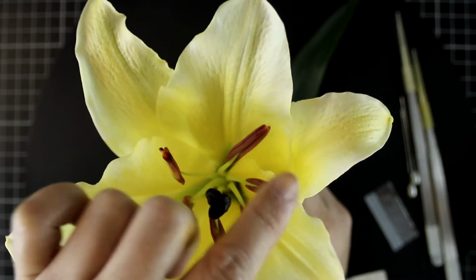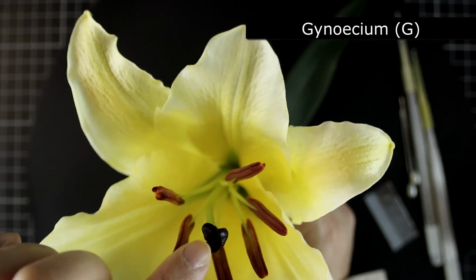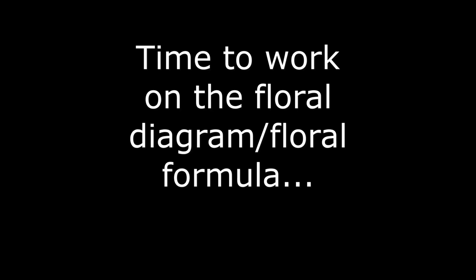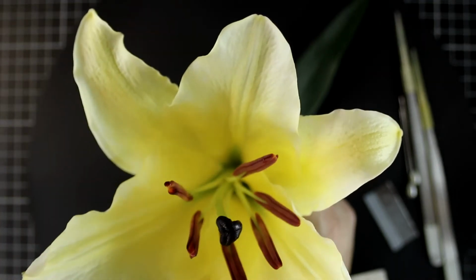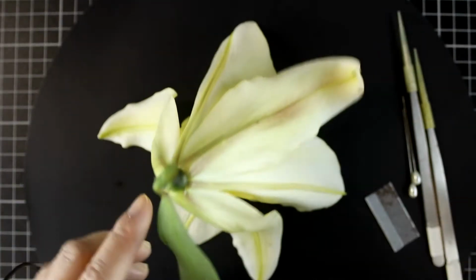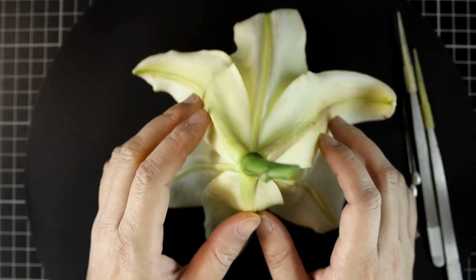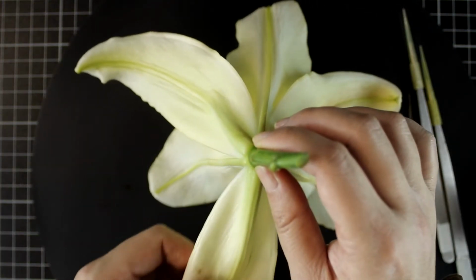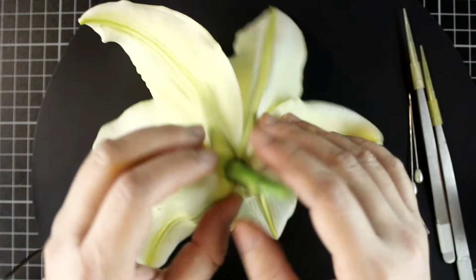Here I show you the stamen, so they belong to the male part, androecium. And the middle one is gynoecium, the female part. The next question is whether these parts are fused together or not. Let's look at the bottom side. First of all, I'll remove the leaf so you can see it clearly. From the bottom side, you can see that each tepal is well separated. So they are not fused together.